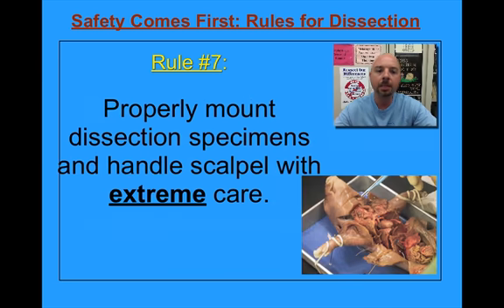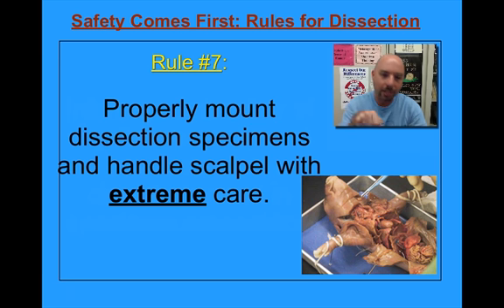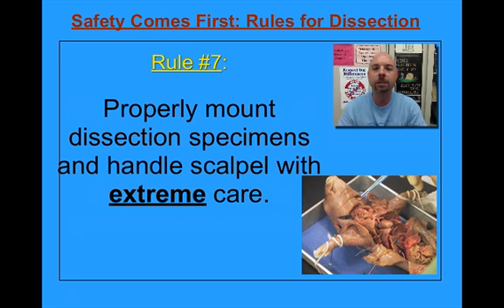Rule number seven is when we are doing dissections, we always want to make sure that we properly mount our dissections and handle the instruments — particularly the scalpel — with extreme care. We never do any dissections by holding the specimen and cutting into it with the scalpel. We also don't handle the scalpel the way we would handle a steak knife; we're not trying to saw into our specimen. And if you really have to struggle or work at cutting into your specimen, you're doing something wrong. Take a breath, step back, and re-evaluate what you're doing.